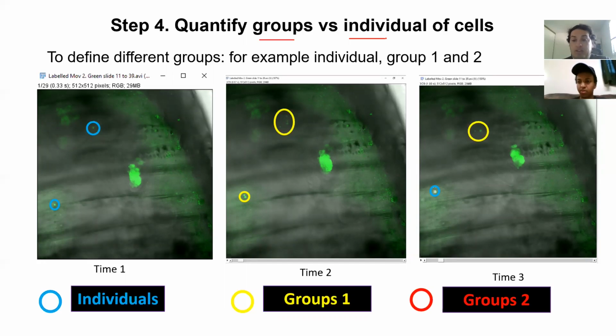What I saw is the following thing. I saw individual cells, individual spots many times. However, I saw also some of them that form groups. So for example, here there are 2 together. And here they are not, and this one seems to be almost attached to each other.